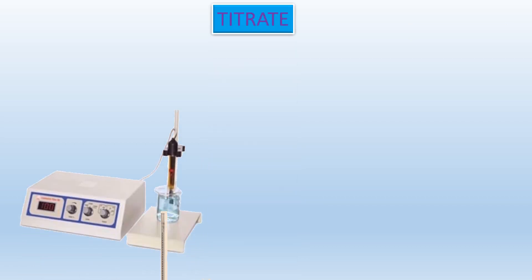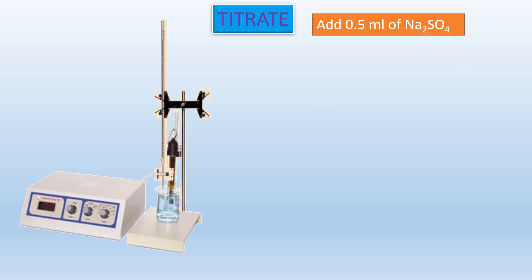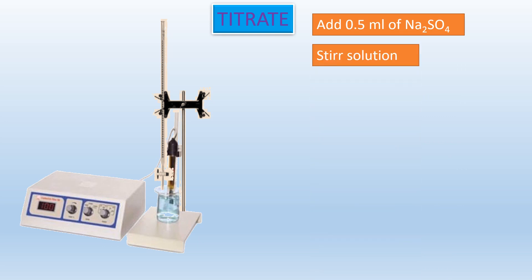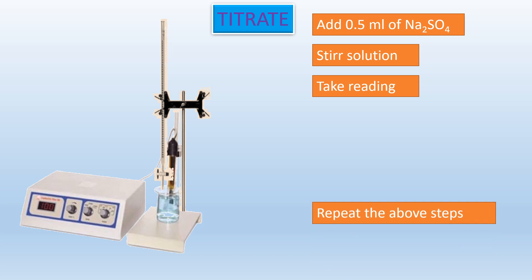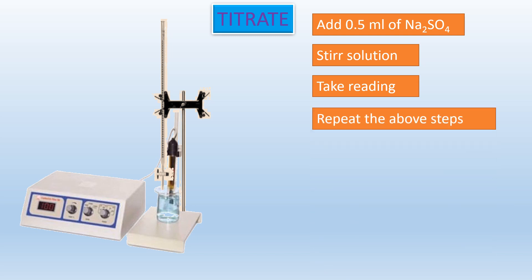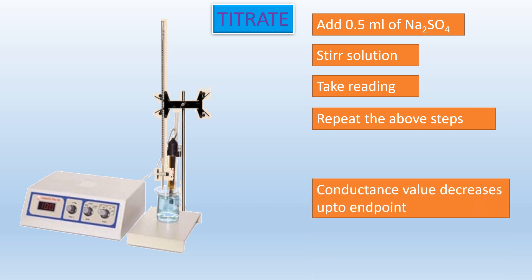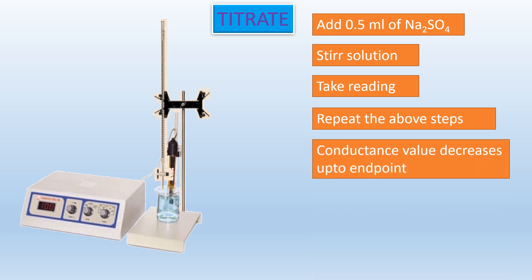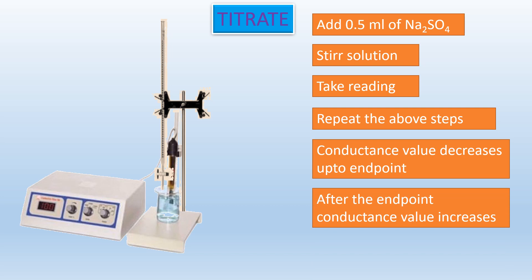Now let us titrate. Add 0.5 ml of sodium sulphate, stir nicely, then take the reading. Repeat the above step — again add 0.5 ml of sodium sulphate, stir nicely, and take the reading. The conductance value decreases up to the end point.